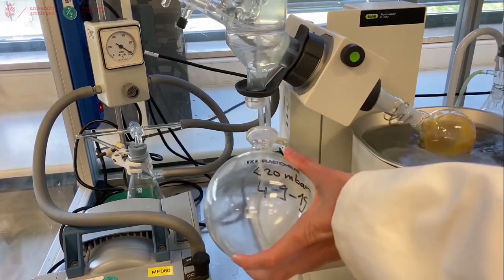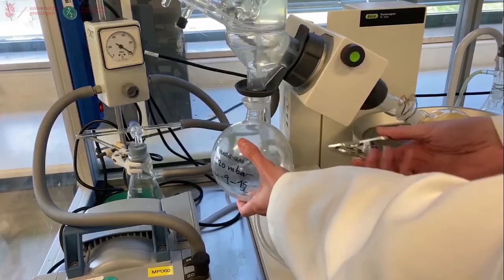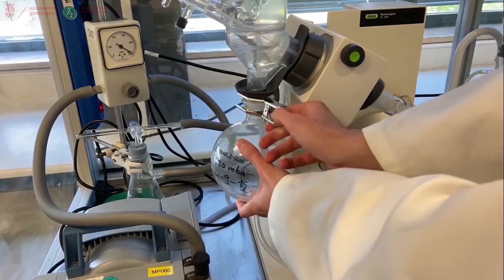Now that our waste flask is empty and dry, we can place it back on the Rotary Evaporator. And make sure to clamp it tight.